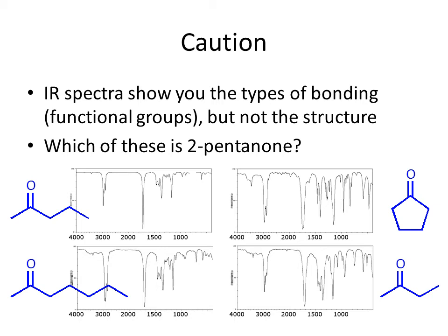These others are for other ketones, because you know what? Any saturated ketone, that is, with no alkenes or alkynes, they're all going to have the same type of signal. And notice there are similarities between each of these spectra, right? There's a signal here and a signal here. They don't look exactly the same, but they're in pretty much the same area. But notice there's also differences. Compare this region here to this region over here.